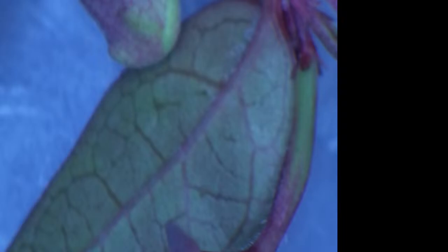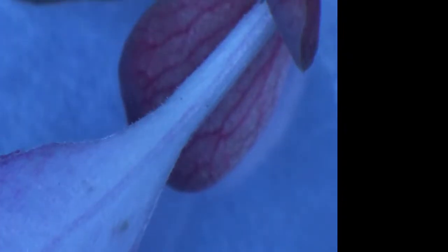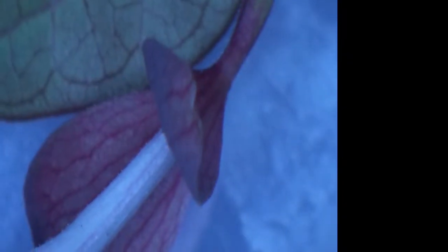And the other side of the leaves, you can see the venation. And in this case, it's a reddish color. That plant there. Nice little flowers and colorful leaves. On to the next one.